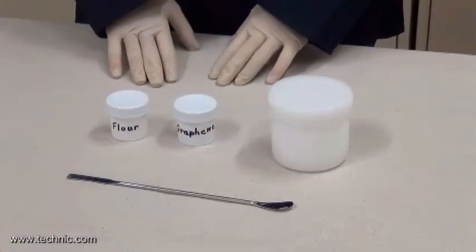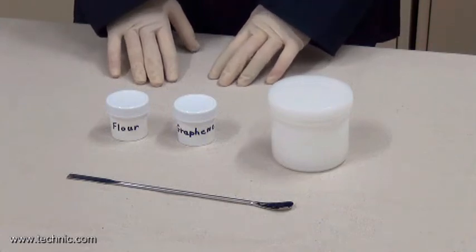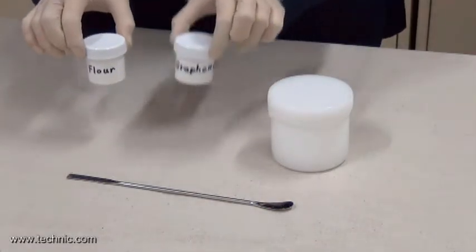Today we will demonstrate that the Mazira Star can mix dry solid powders. As you can see, we have some flour and some graphene powder.